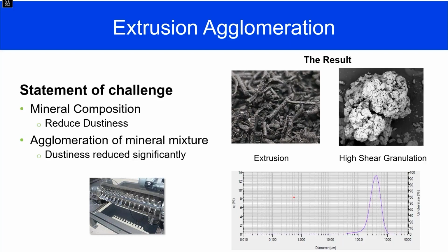In the meantime, we also looked at a high shear granulation system, and that's what I have down here. This is a turbulizer that you can dry in, but you can also granulate in, and we did this in here. You can see the granule that we made here. There's not a scale on here, but this is about a 400 or 500 micron granule, and it's a very tight granule. It's not that grape cluster.